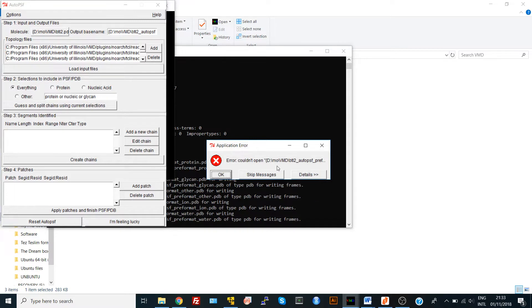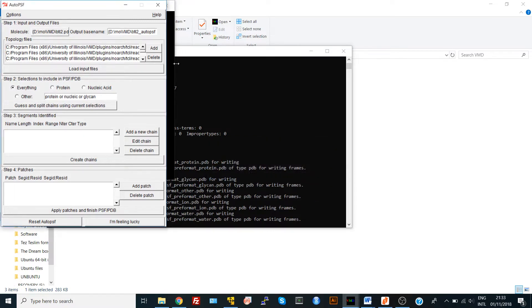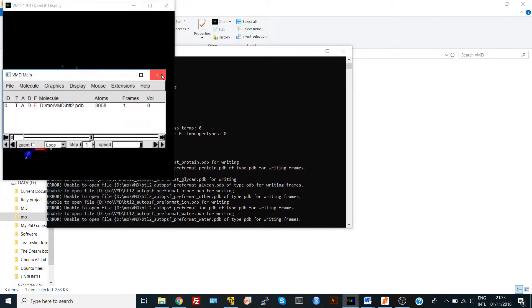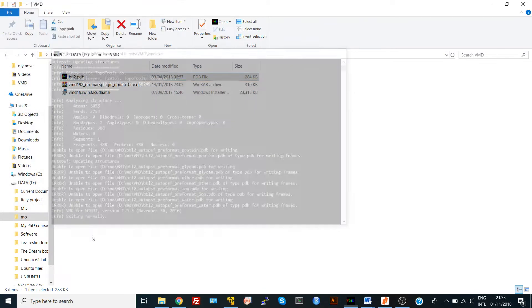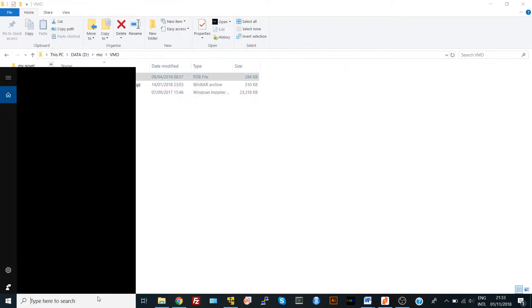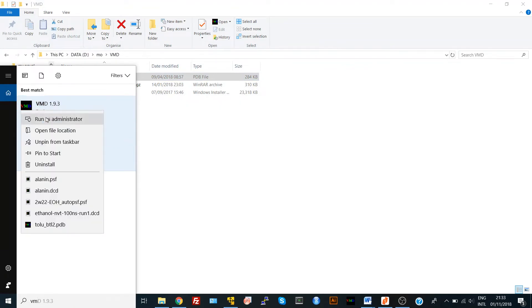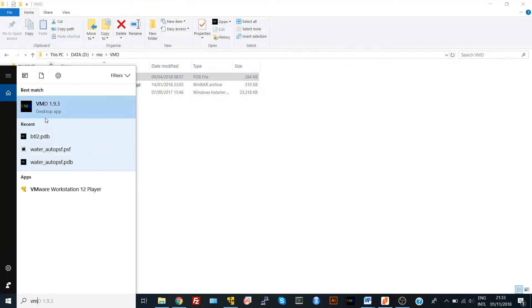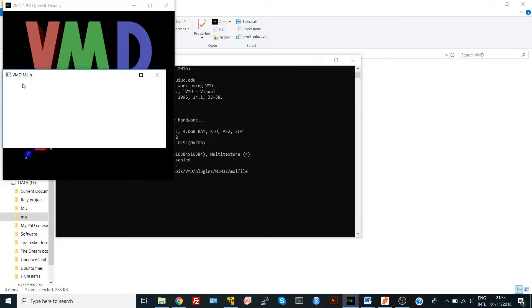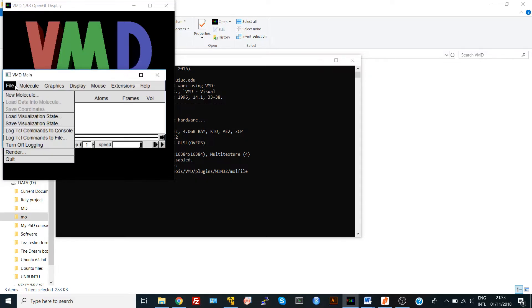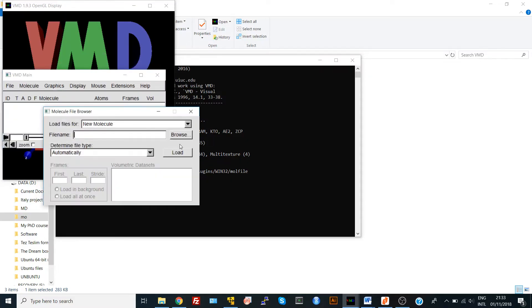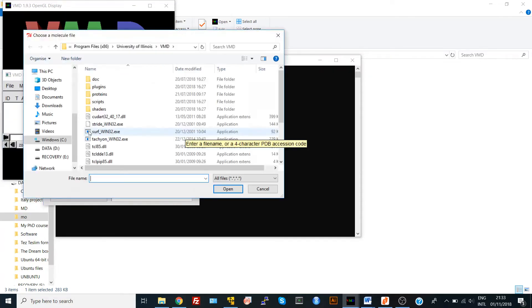What you should do is close everything and go here for VMD and select Run as Administrator. You say yes, and you get your file from File Browser. We have it here in VMD and you load it.